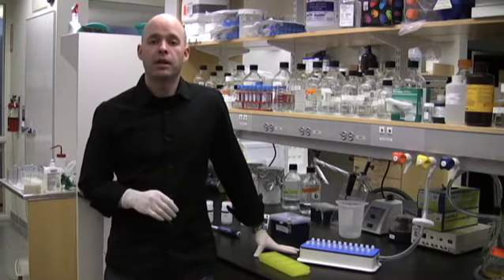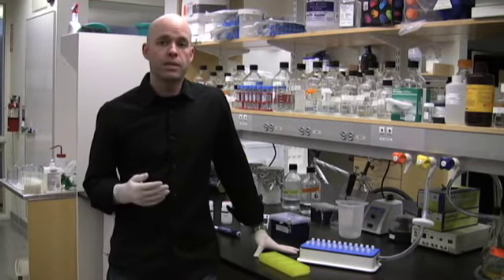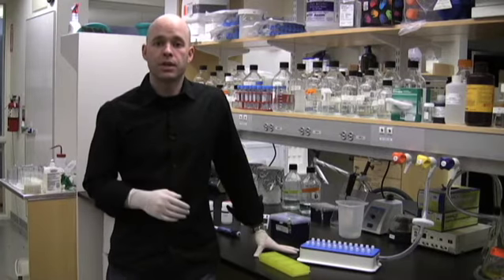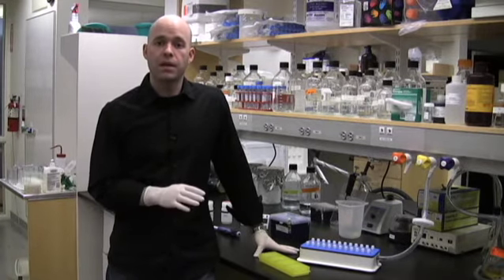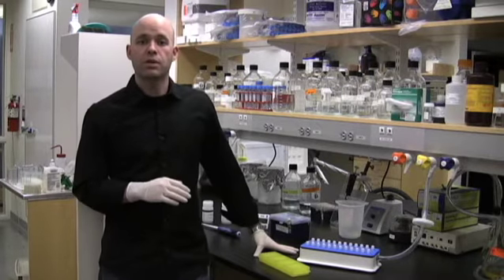Mini preps are a pretty routine part of molecular biology, but they can often be tedious, and when you have a lot of samples they can take up a lot of time. So today we're going to talk about a couple of time-saving tips that'll get you through this process much quicker.